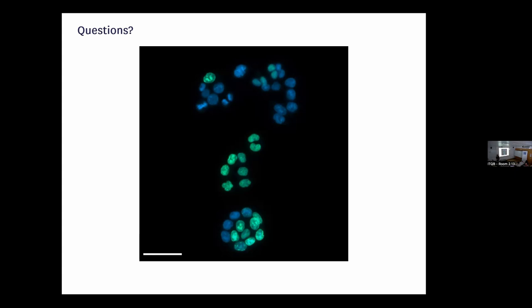But to affect imaging, I would say that Pedro probably can complement this, but only if you go really single molecule, like 4 or 5 nanometers, that kind of distance, you can have maybe a resonance transfer affecting the localization of your fluorophores, because you'll be detecting from nearby fluorophores instead of the one that you wanted to image. That's right. You have to really push it in order to do that. So it should happen, but it would have to be very, very special.